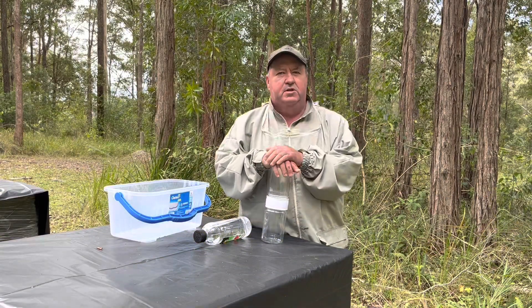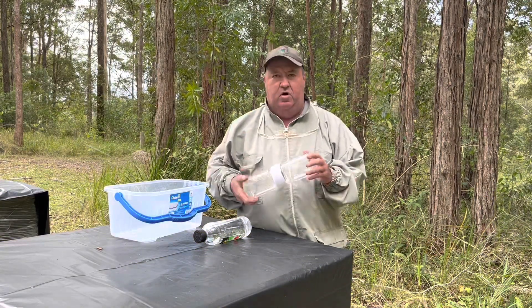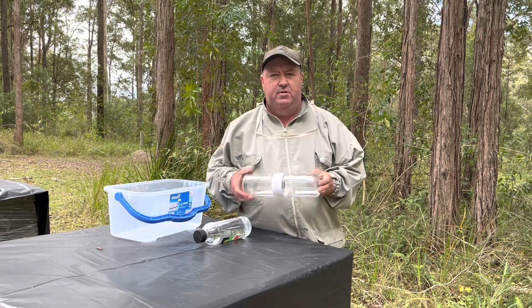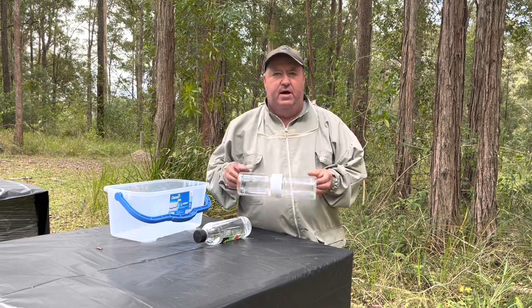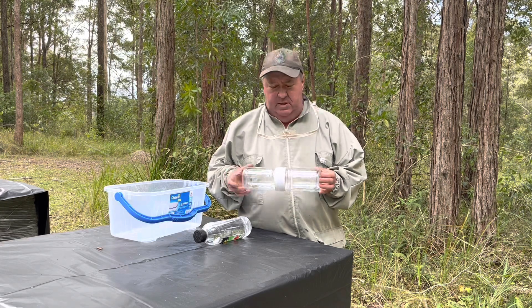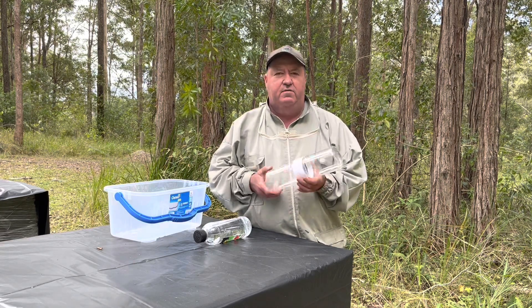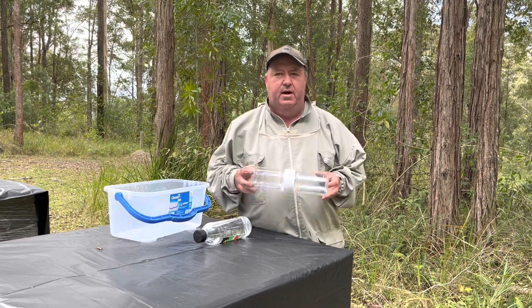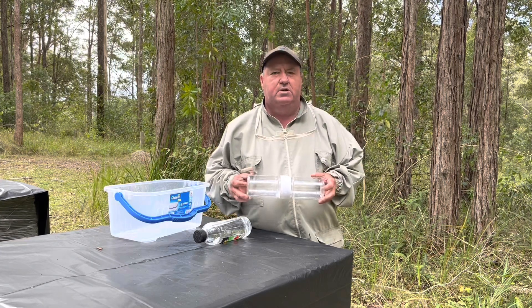G'day, welcome to Mount Cranberry Apiculture. Just wanted to have a chat about these alcohol wash bottles. Under the new biosecurity code of practice, you need to do an alcohol wash every 16 weeks, or every four months. Up to 64 hives, you need to do all your hives.